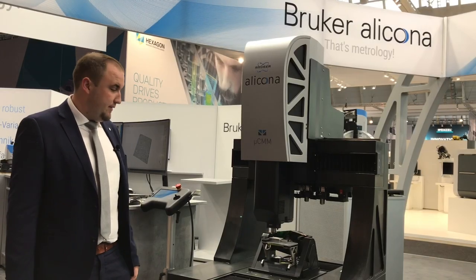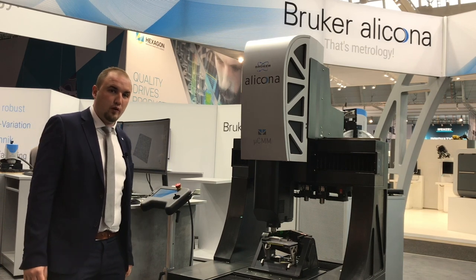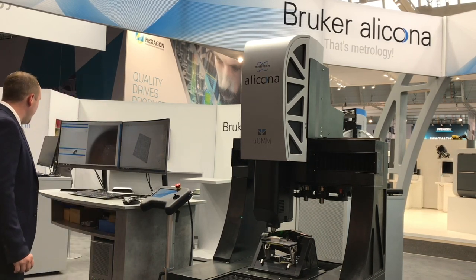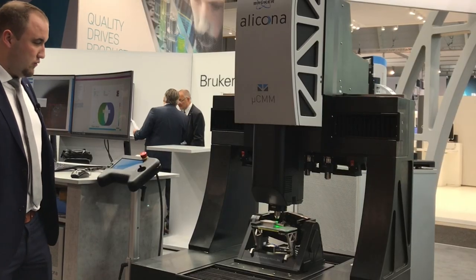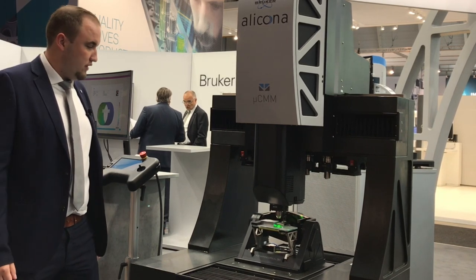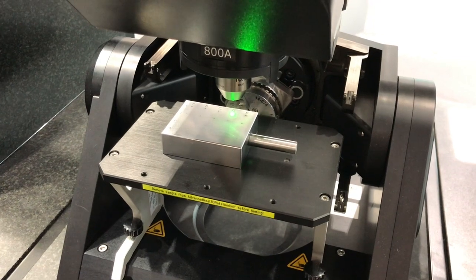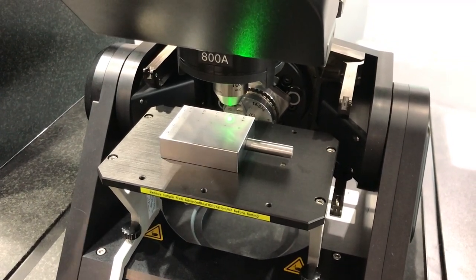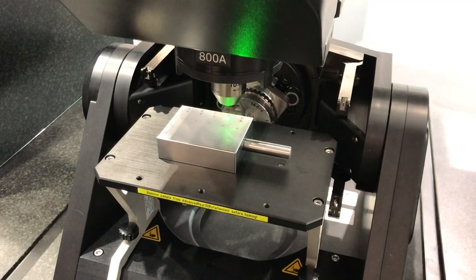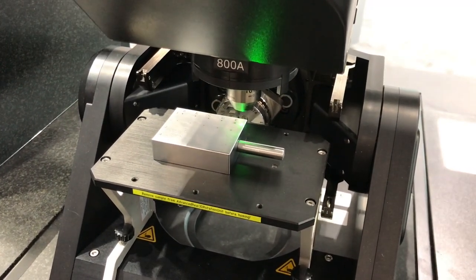In addition to conventional single measurements, several measurements or entire measurement programs can also be performed automatically. In this automation example, you see our latest development: the vertical focus probing technology. This extension of focus variation allows the measurement of vertical surfaces and micro-drillings. This means that we can measure components with flanks of more than 90 degrees.